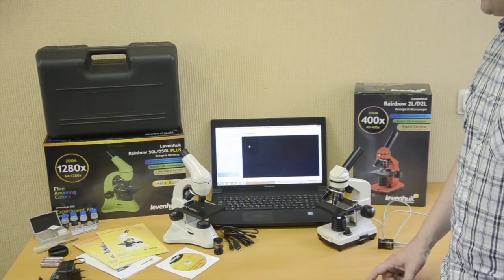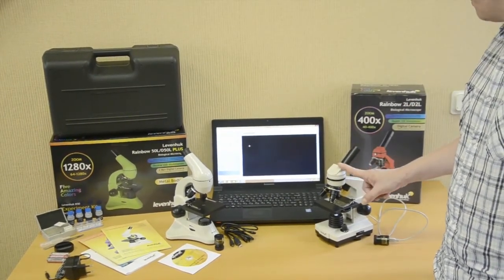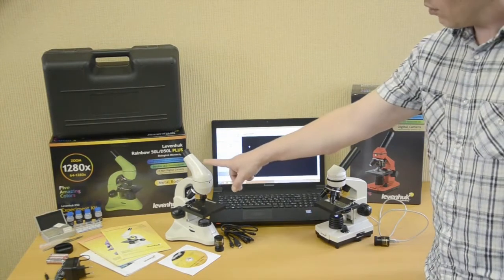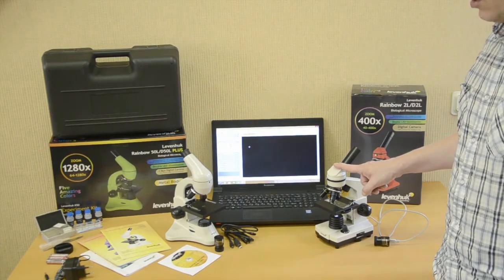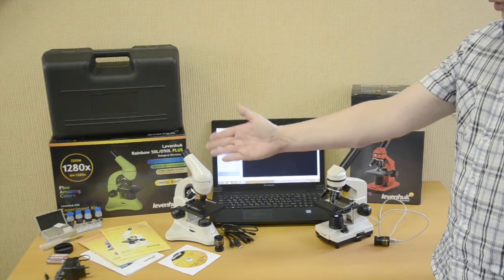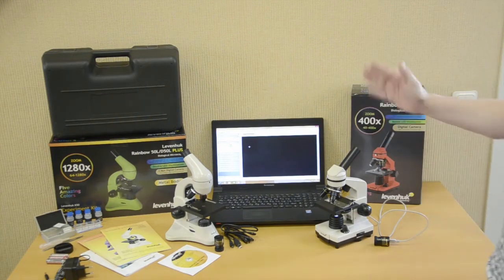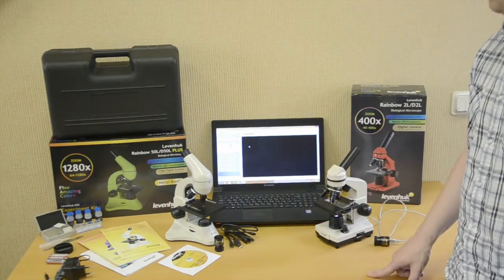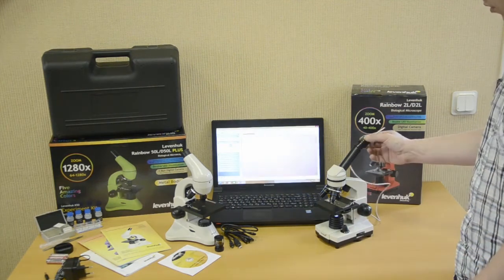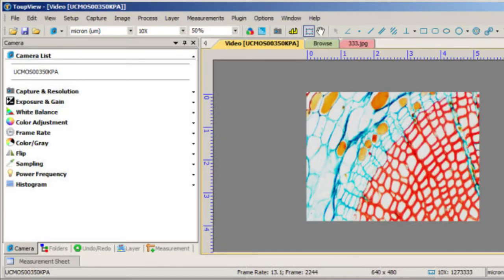The Levenhuk Rainbow microscope family also has two digital models. The body is plastic in the D2L and metal in the D50L Plus. The digital camera is 2 megapixels for the Rainbow D50L Plus or 0.3 megapixels for the Rainbow D2L. Maximum resolution is 1280X in the D50L Plus and 400X in the D2L. Both models come with an experiment kit, and the Rainbow D50L Plus also has a plastic case. Camera connection is simple: run the Levenhuk ToupView software on your PC, connect the USB cable to the PC and camera, insert the camera into the eyepiece tube in place of the eyepiece, and adjust sharpness with the focusing wheel. The ToupView application allows editing and saving captured images or videos.